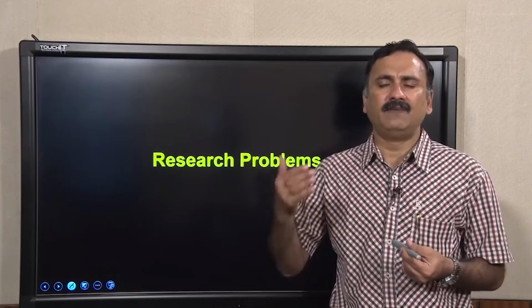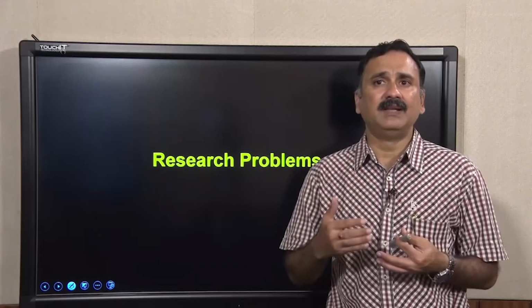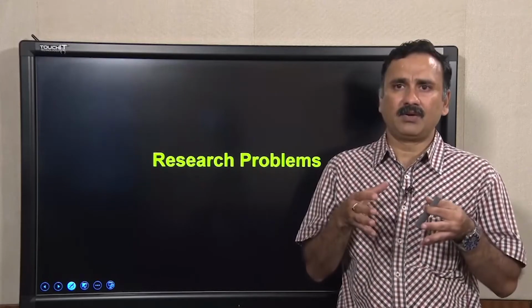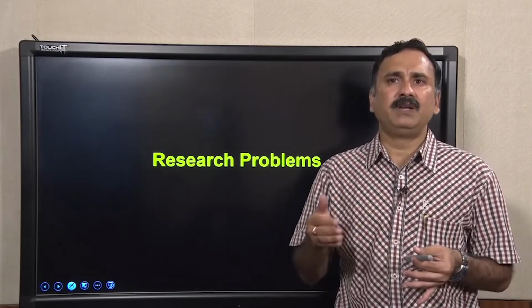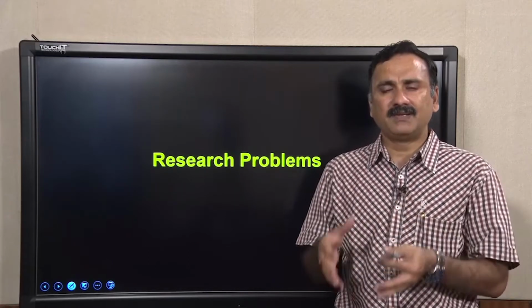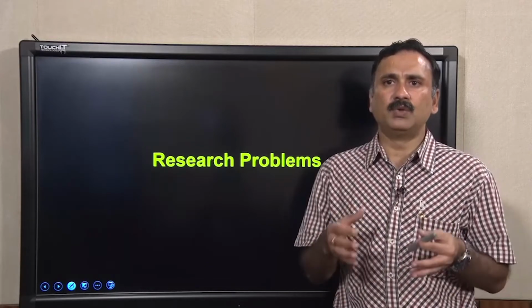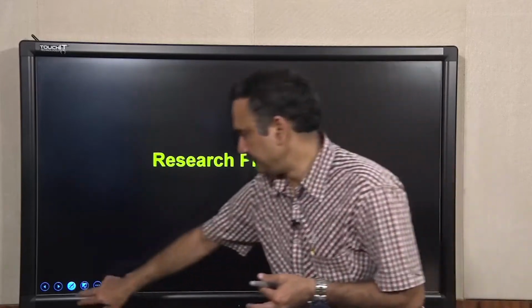The basic idea is to emphasize that gel filtration chromatography is a very robust tool to answer many complicated questions, and performing it is easy. So, if you are interested, you can utilize gel filtration chromatography as one of the tools to answer these questions. So, let us start with the first question.